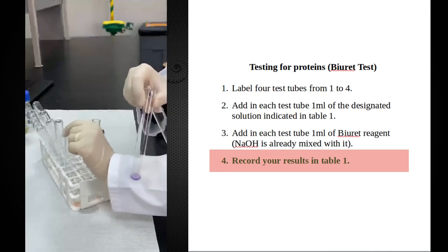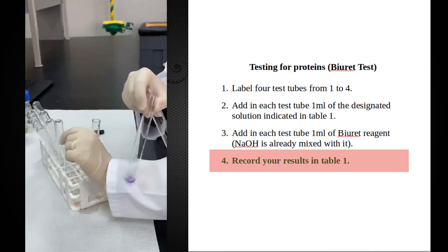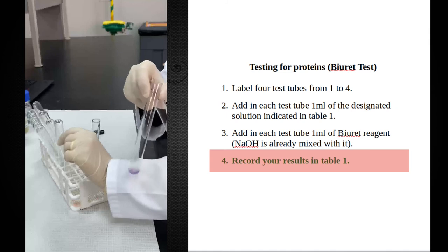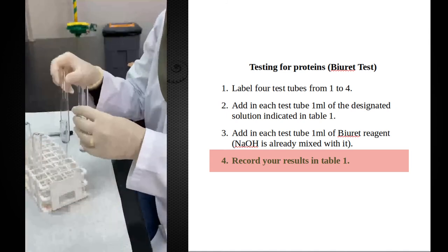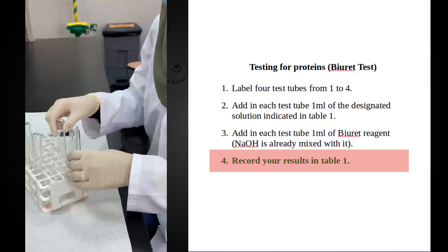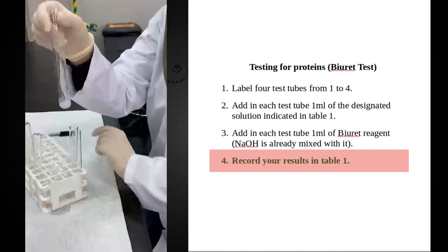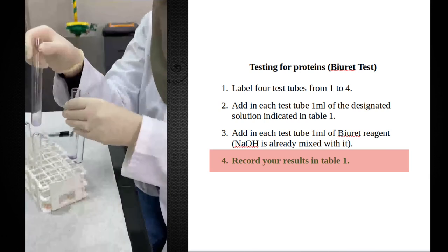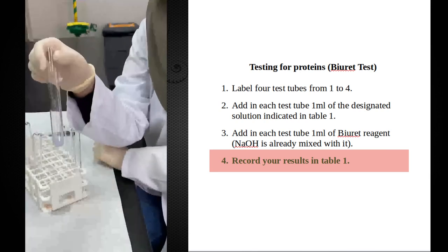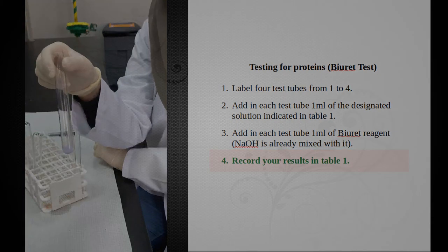And this is the albumin test tube, and this is how a positive result looks like. Negative control, positive control - distilled water, albumin. We look at the milk to identify if it has protein or not. The color, as you can see, is closer to the positive control. It's a violet color, which indicates that milk contains protein.